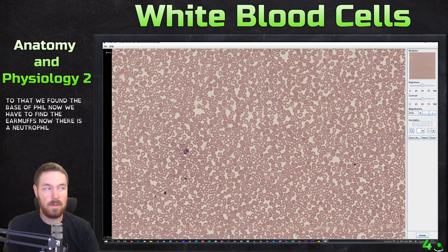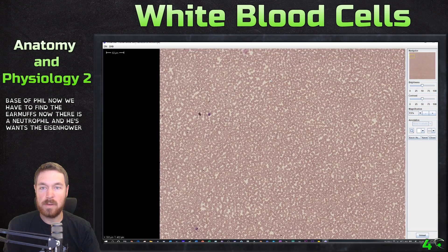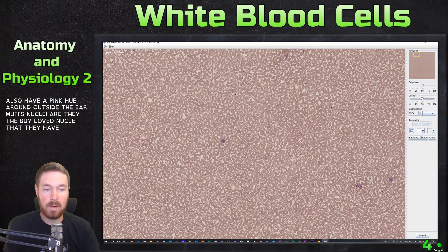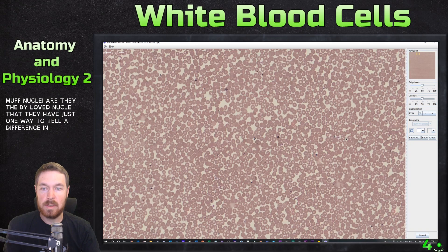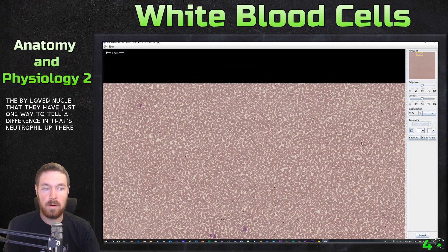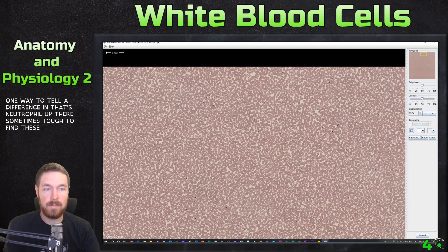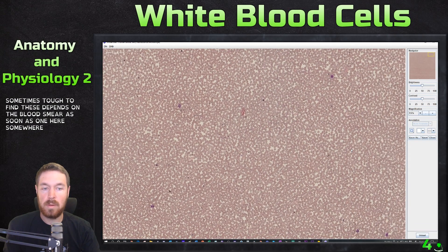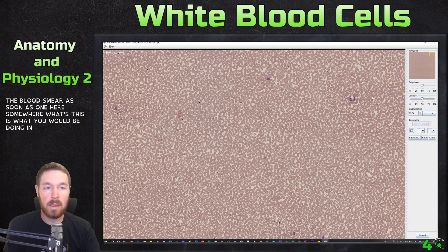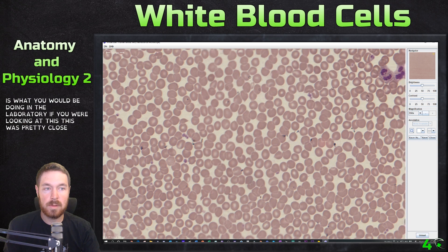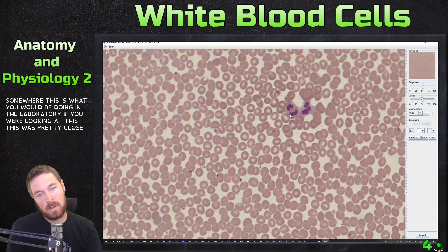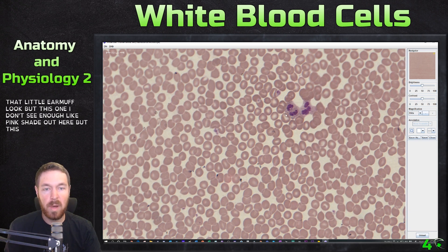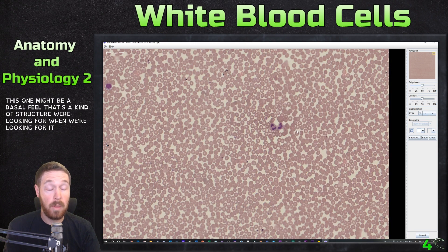Now we need to find the eosinophil with that earmuff look. Eosinophils also have a pink hue around the outside of the bi-lobed nuclei — that's one way to tell them apart from neutrophils. Here you can kind of see that little earmuff look, but I don't see enough pink shading. We're looking for a bi-lobed earmuff shape with pink granulation around the outside.